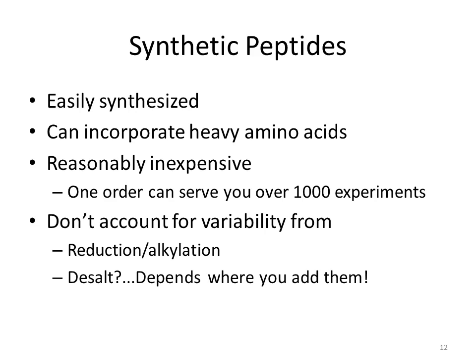And you have to remember that when your peptide is being generated from the protein, it happens at some point, not at time 0. So if you add your heavy peptide in at time 0, it's got an offset. The internal standard is put in at time 0, and your actual light peptide is generated at t plus n, some other time that's a little bit later. So they aren't going through the same exact process at the same exact time.